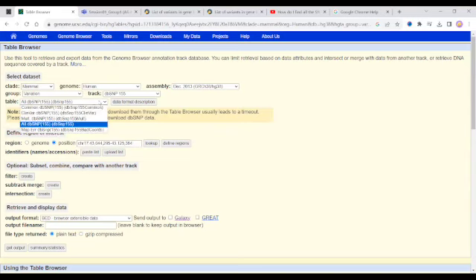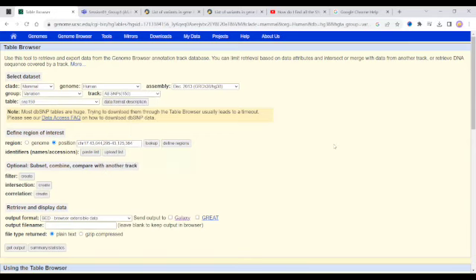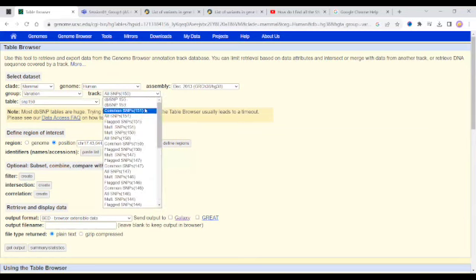And one more thing: if you want to answer more realistically, not the common SNPs but all of them, the dbSNP 155 database might be a better, more realistic solution. But still, as the version goes up, you will get more and more. Can you click get output and get summary statistics for the common SNPs?